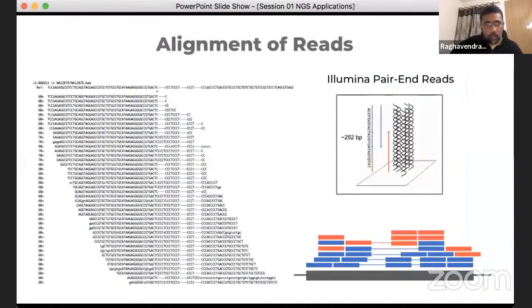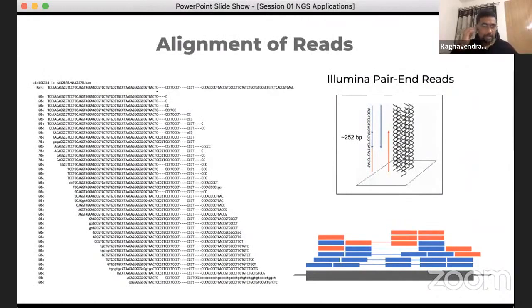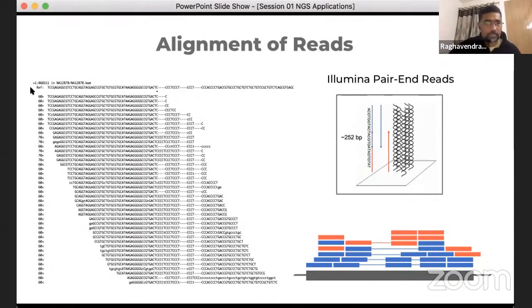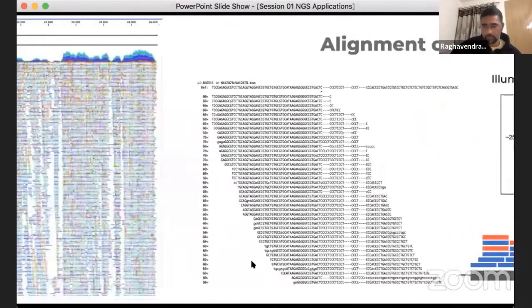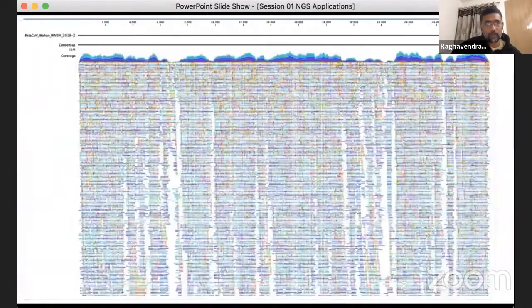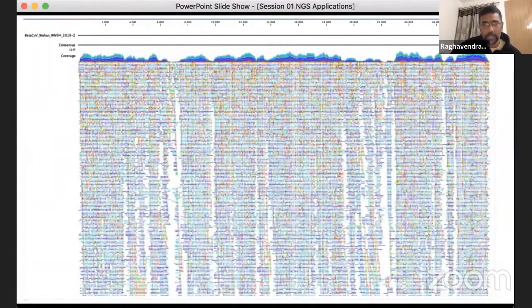What happens is the FASTQ files, which represent the sequenced reads, are mapped onto the reference genome in the FASTA file. Here you can see the reference genome and the reads that are mapped onto specific positions based on their sequence alignment and sequence identity. This is a detailed view of how the mapping is performed and how it can be visualized.